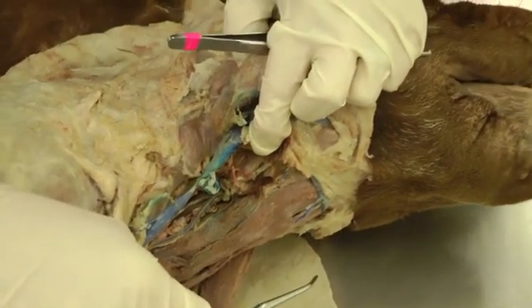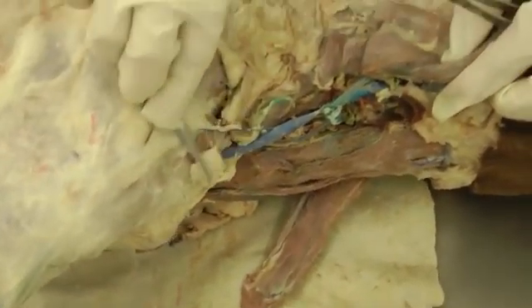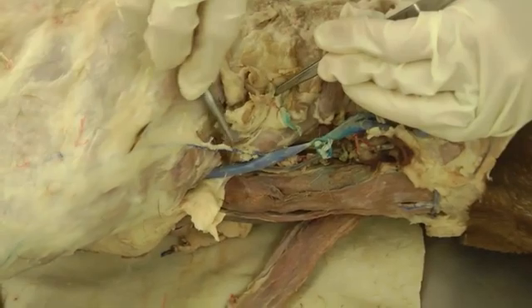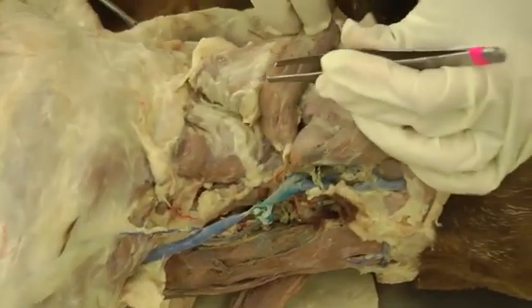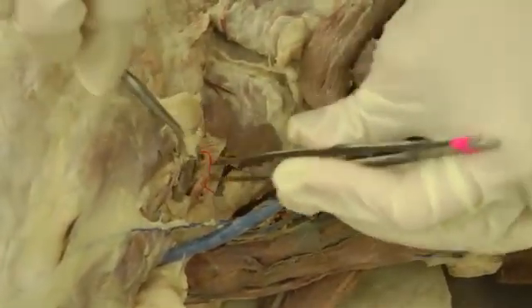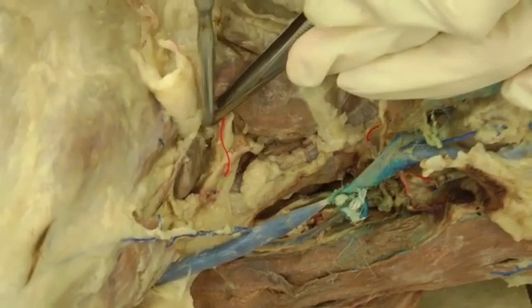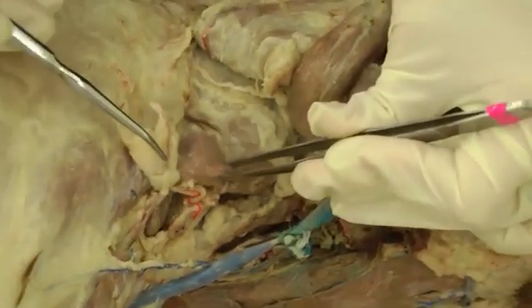Then we have the superficial cervical lymph nodes, which we found on the other side. The book is going to tell you to cut your brachiocephalicus muscle — find the borders, cut, and reflect that up towards the head. You should be able to find at least one, maybe more, superficial cervical lymph nodes right here — this oval body right under the omotransversarius.